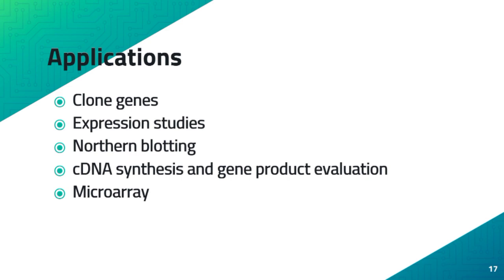Application of isolation and purification of RNA. Cloning genes, expression studies, Northern blotting, cDNA synthesis and gene expression evaluation, and microarray are the applications of isolation and purification of RNA.